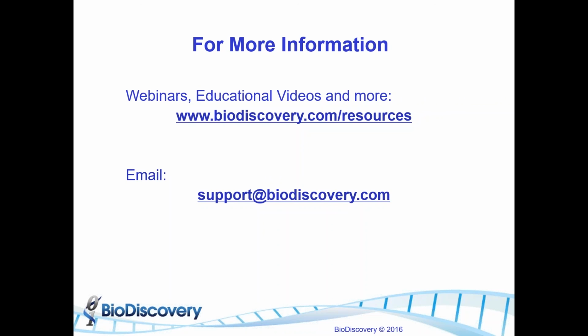So what I like to do when reviewing the samples is start with one setting that's going to fit most samples and then use one alternate setting that should capture the changes in the remaining samples. This is typically a lower level mosaic setting, capturing those changes in the samples that have a slightly lower affected cell population. If you're using alternate settings, it's always important that you make a note of those samples and refer to that when you're writing up your methods or presenting, so that everybody's aware that you have used alternate settings. But it's perfectly acceptable to use more than one setting as needed to best reflect the population of cells that are affected in your samples.